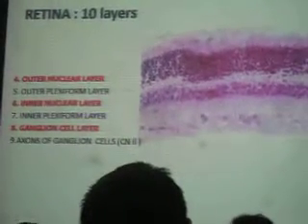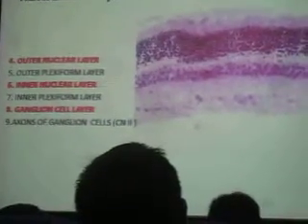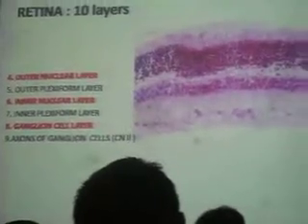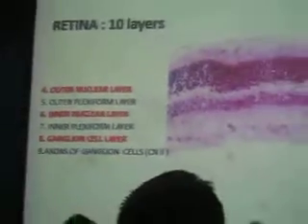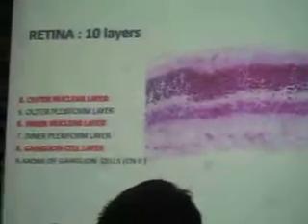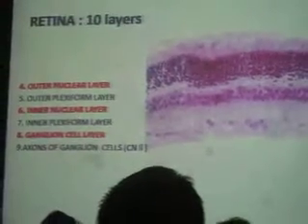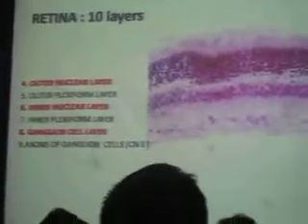Okay, so you have earlier the connections of the dendrites of your ganglion cells with the axons of your bipolar cells of the inner nuclear layer, as we said before. This time, the axons of your ganglion cells will make up a special layer. These axons will eventually exit the eyeball as a single unit. That will be your optic nerve.